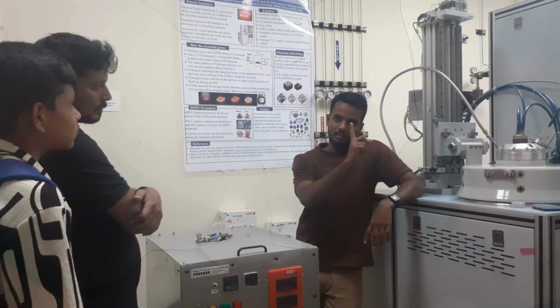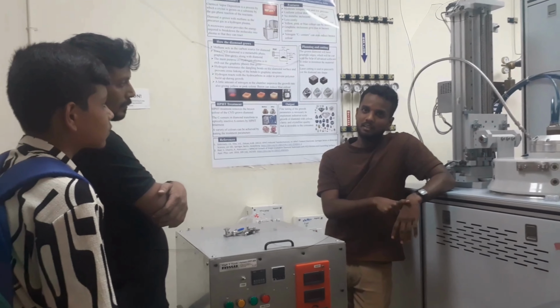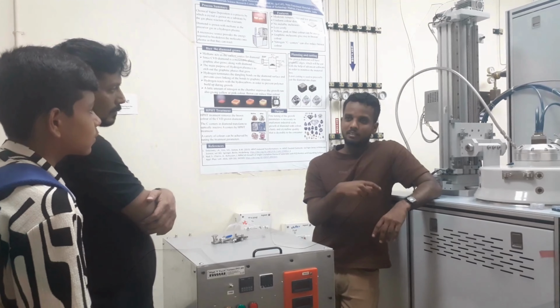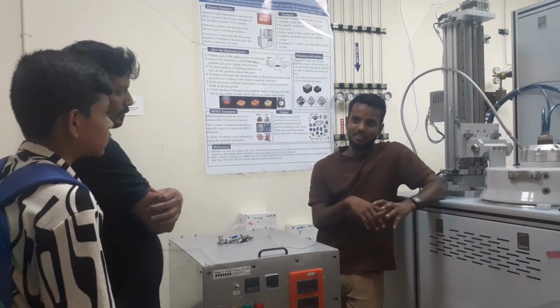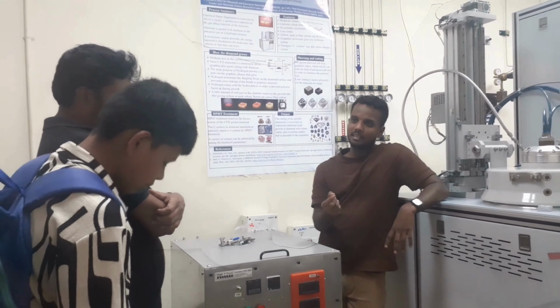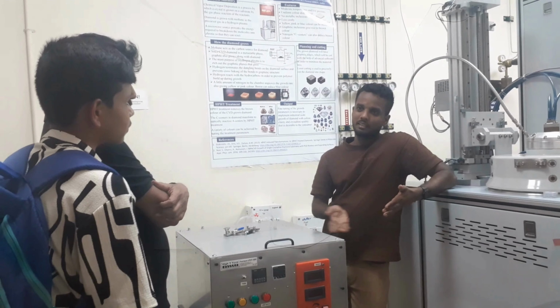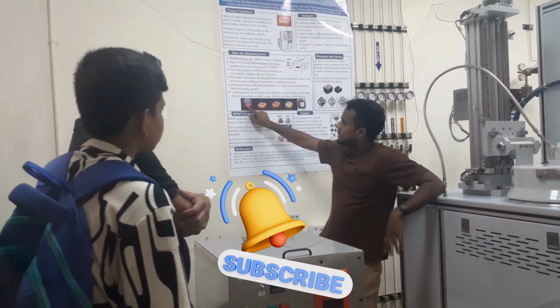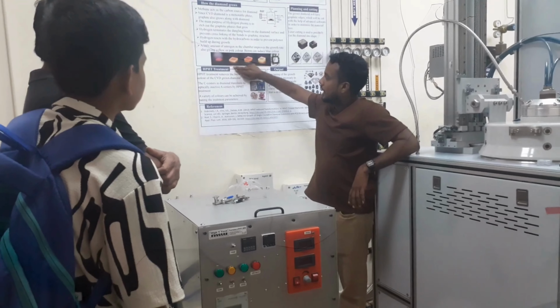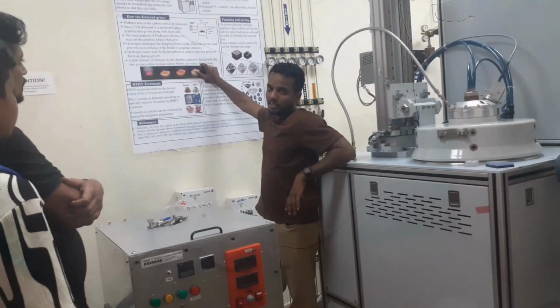After that we pass the methane gas inside. In the high energy plasma, the methane breaks down and free radicals are created. More than 100 types of chemical reactions occur, and at the end of these reactions we get carbon. The carbon is deposited over the diamond substrate. You can see the images. This is the substrate. After some hours, after some weeks, finally we will get a diamond.